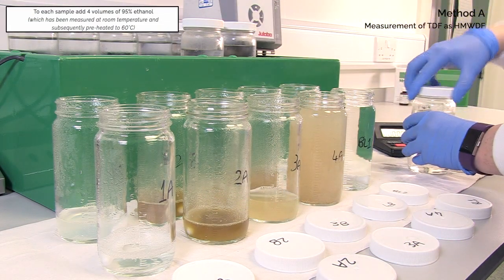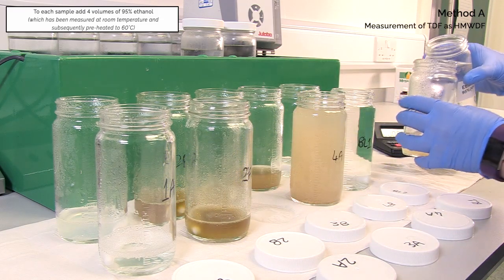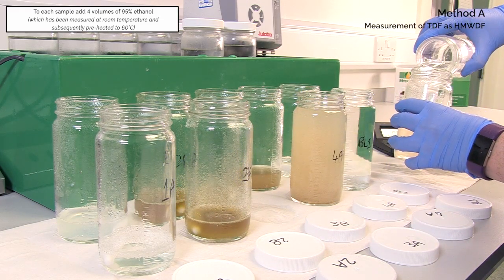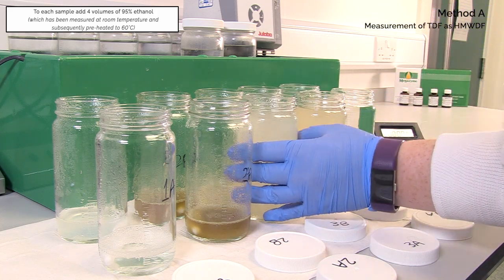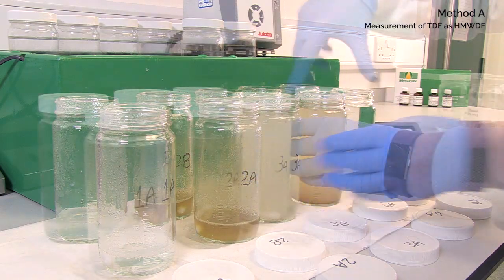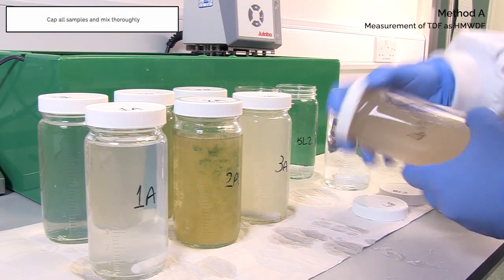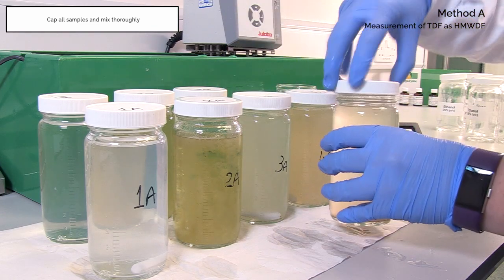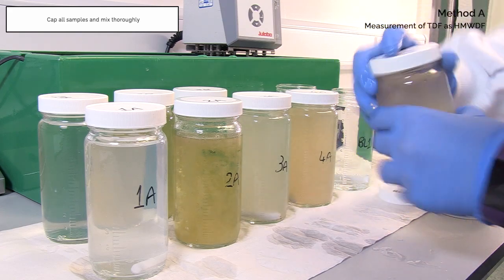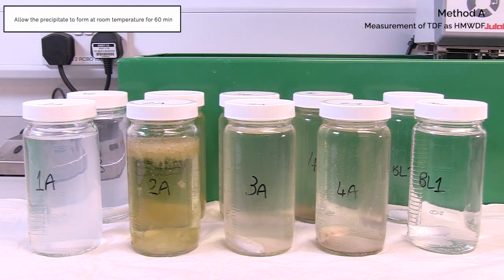To each sample, add 4 volumes of 95% ethanol which has been measured at room temperature and subsequently preheated to 60 degrees Celsius. Cap all samples and mix thoroughly. Allow the precipitate to form at room temperature for 60 minutes.